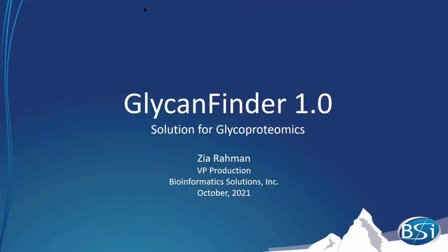Hello, everyone. So is my screen shared? Yes, it is. Okay. So hello again. Today I'm going to introduce you to the new software tool that we are working on: GlycanFinder, our solution for glycoproteomics. Before going into the software, first let's start with some basics.